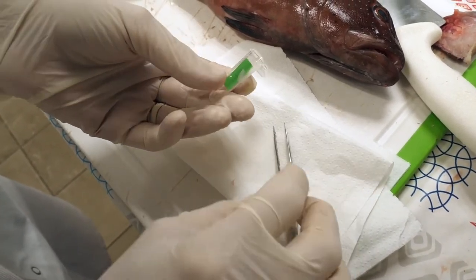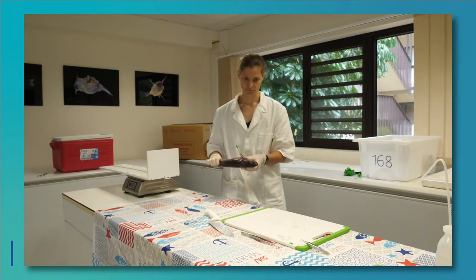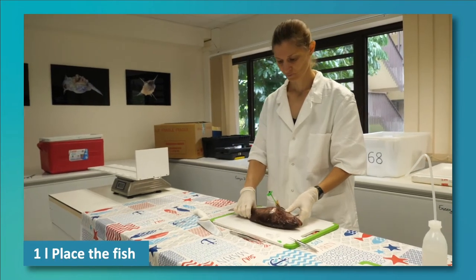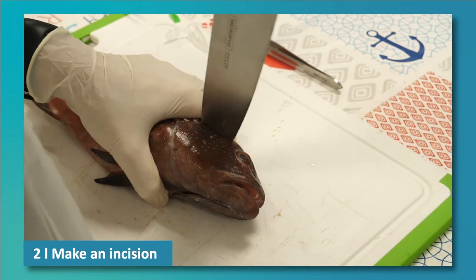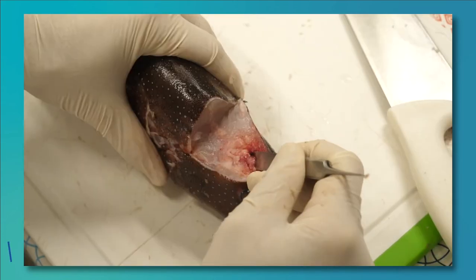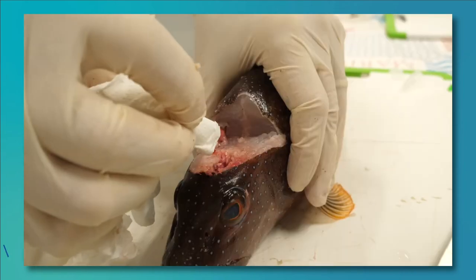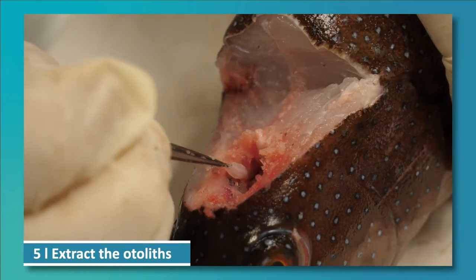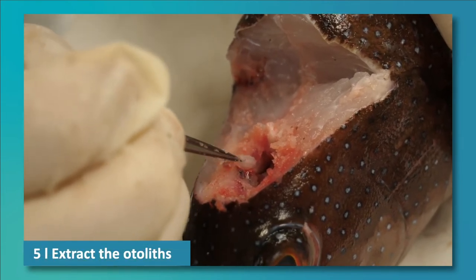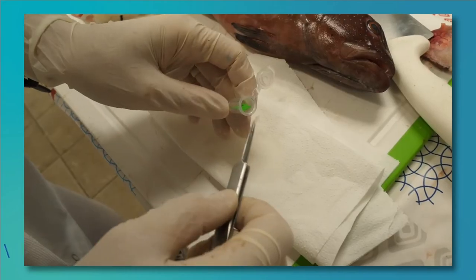Did you follow all that? Here is a summary of the method. Place the fish on a cutting board. Using a knife, make an incision between the gill cover and the eye. Remove the fish brain to obtain access to the cavities. If necessary, use paper towel so that you can see the cavities. Extract the otoliths using tweezers. Clean and dry the otoliths and place them in a labelled container.